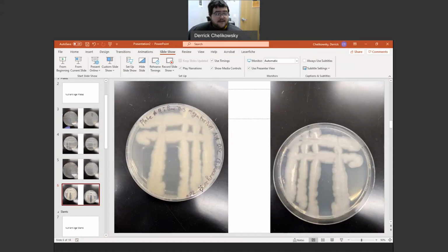And this is Bacillus megaterium, and as you can see, Bacillus tends to take over a plate. This was not after 24 hours, this was after 18. So after 18 hours, it just takes over everything. On your lab guides and worksheets, fill in the table as best as you can using the guides inside your lab manual.